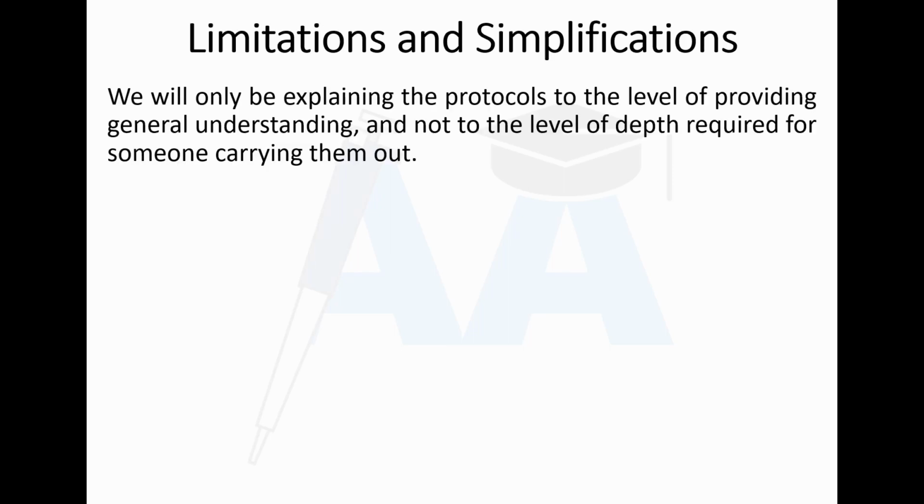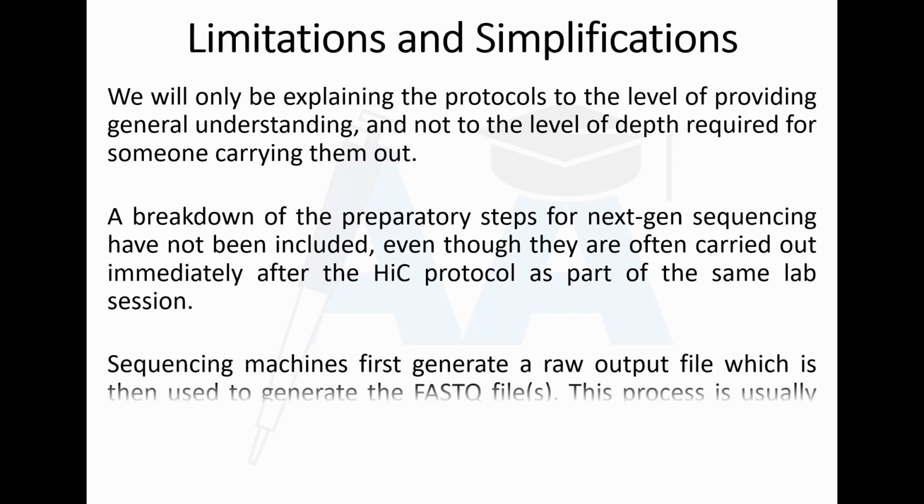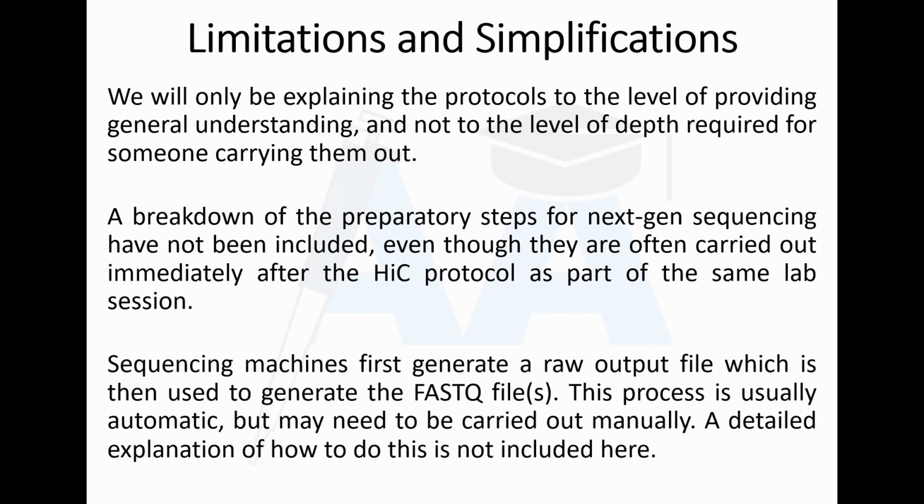Now, in this presentation, I will only explain the parts of the Wetlab protocol required for a general understanding of the whole process, and only to the necessary level of detail. Wetlab procedures like preparing DNA fragments for next-gen sequencing have been omitted, as have the more meticulous levels of detail which are necessary for someone who intends to carry out the experiment. Situational bioinformatics steps, such as the conversion of raw sequencing output files to FASTQ files, are also not included. Everything in this video series is strictly HiC oriented.